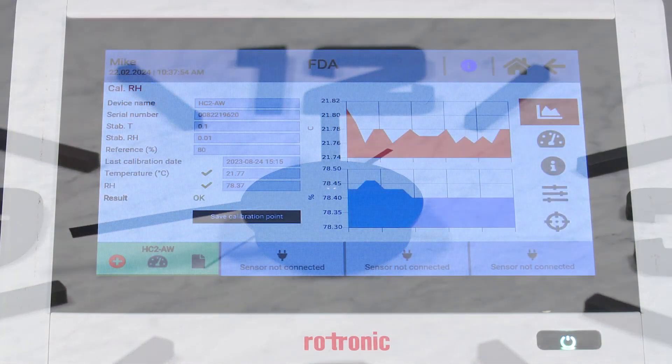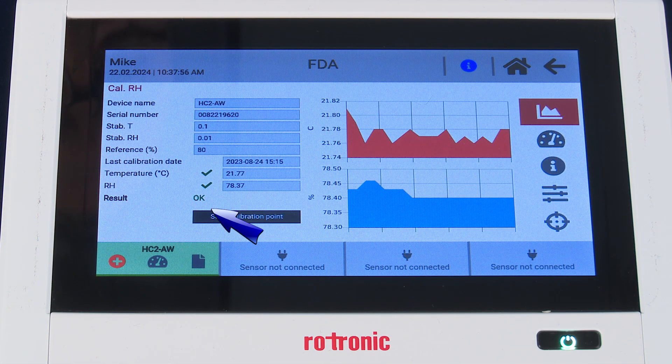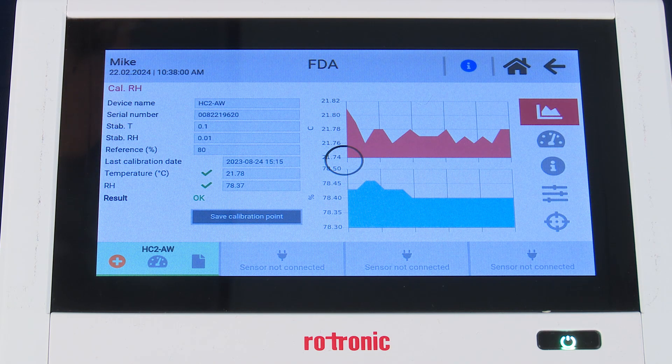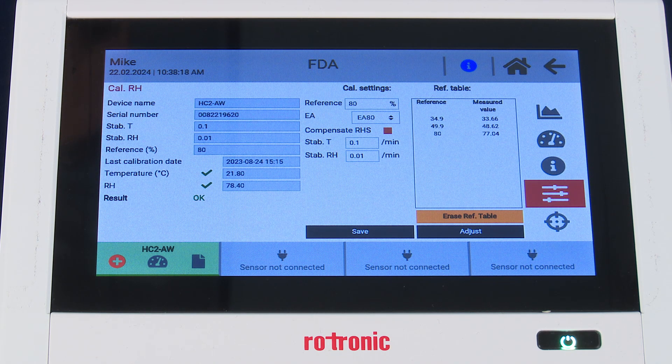The measurement has completed — we have the green OK. We want to save the calibration point. After saving that third calibration point, the screen updates and we can see in the reference table that we now have all three measurement points saved.